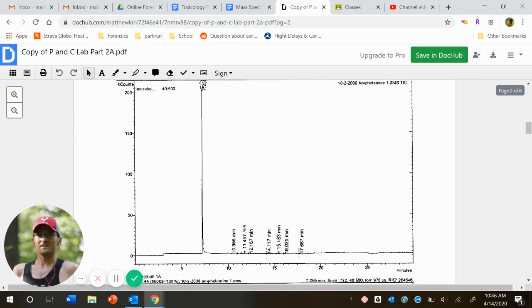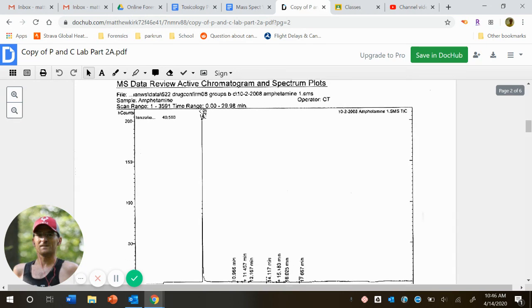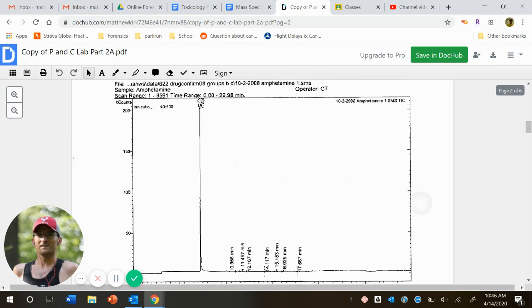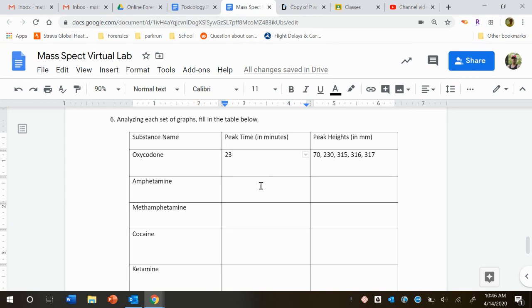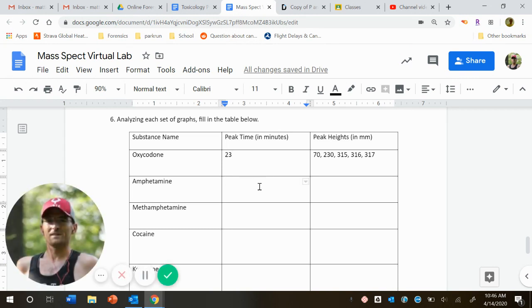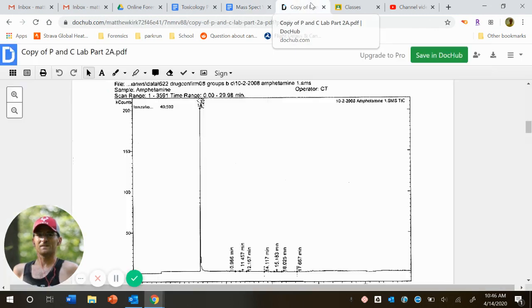Let me do one more for you guys. Let's do amphetamine. So again, let's just look at our big peak here for amphetamine. Again, hard to see, it looks to be about 7.25. So amphetamine's main peak, 7.25 minutes.